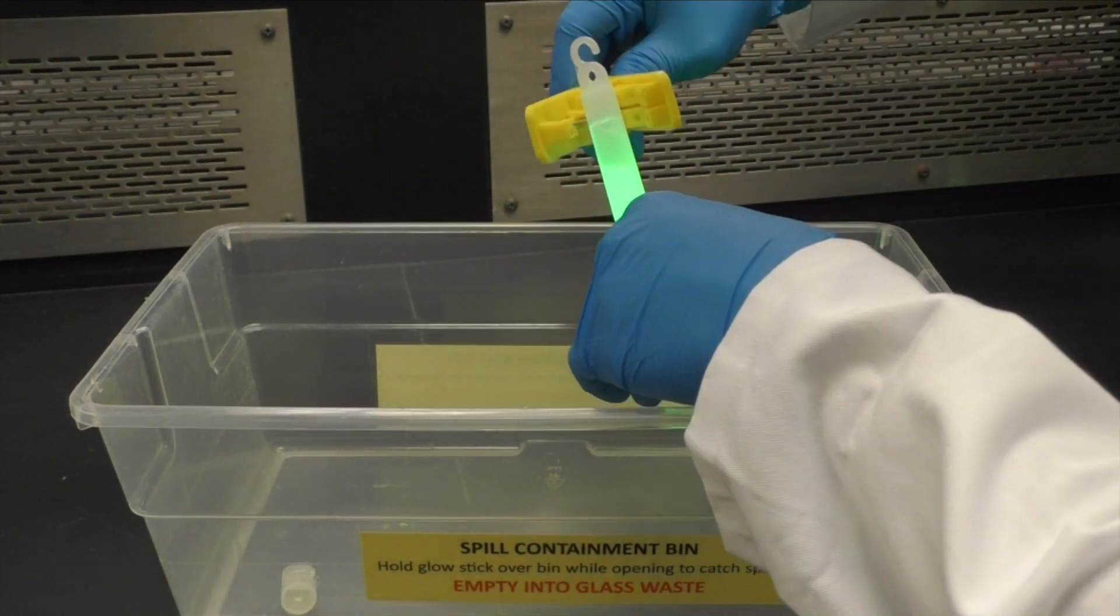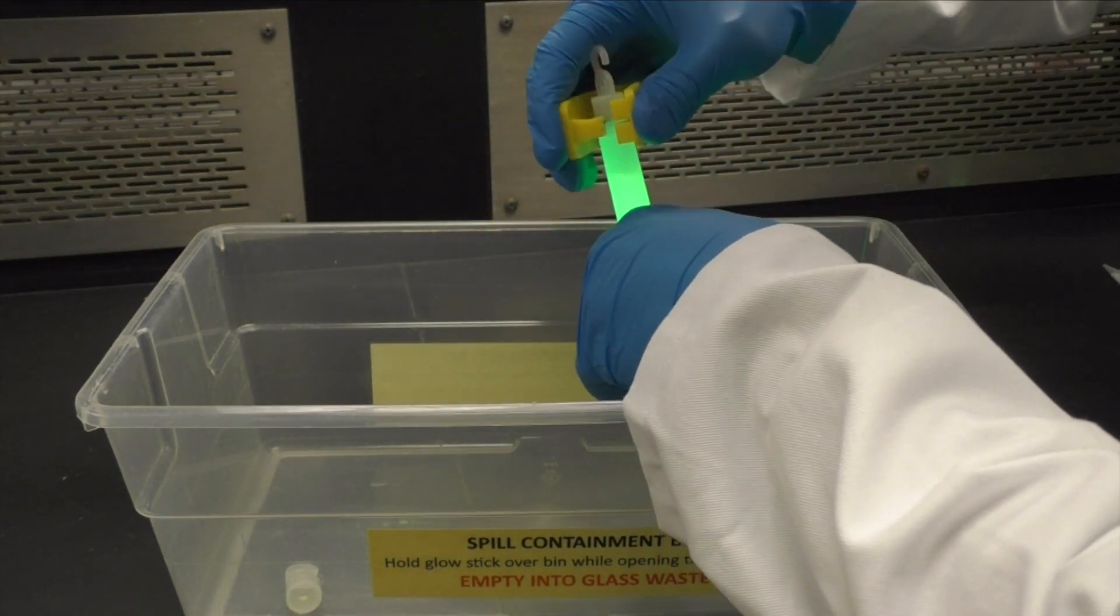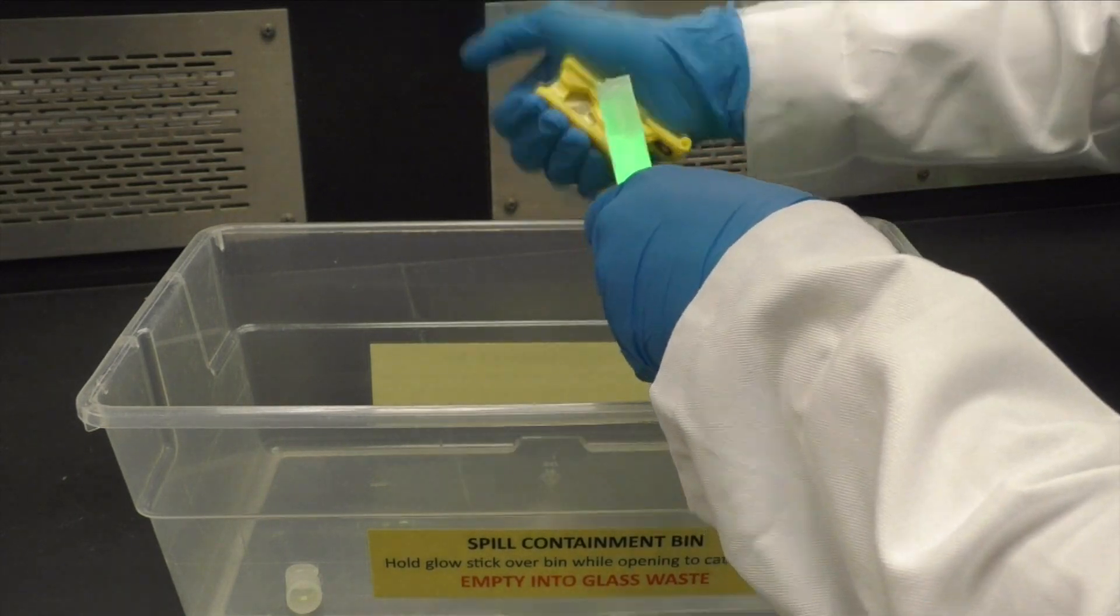Now hold the glow stick upright over the spill bin and apply pressure to the top part of the glow stick using the tubing cutters to snip off the top.